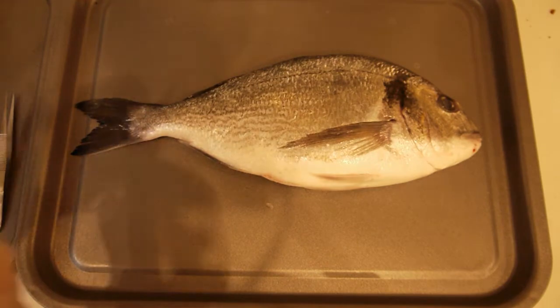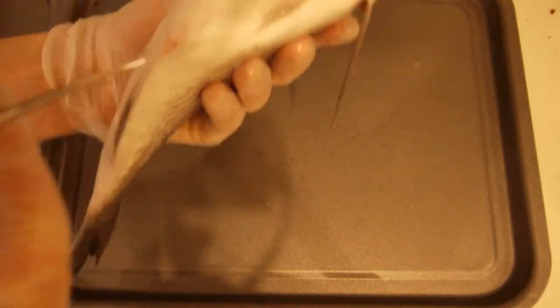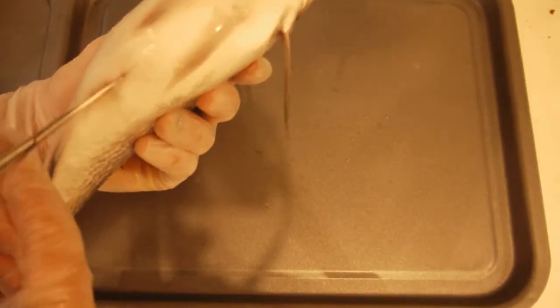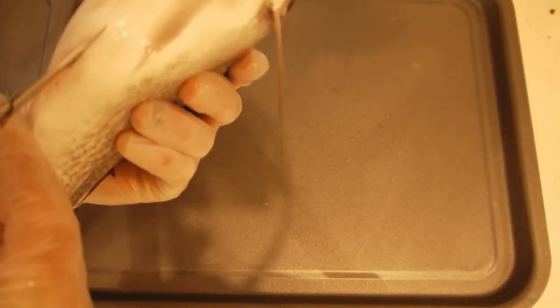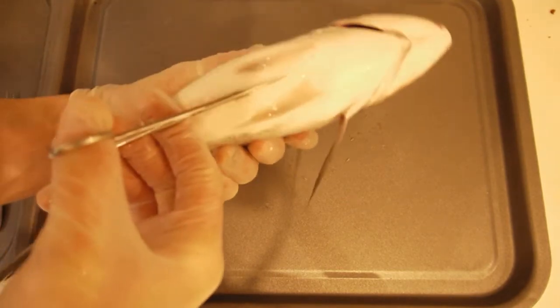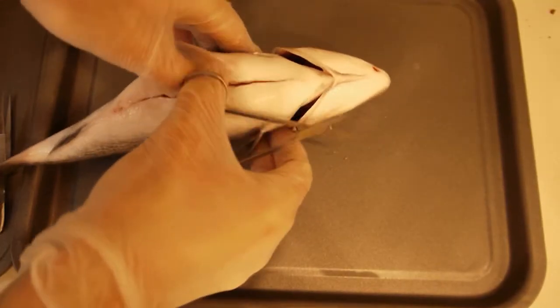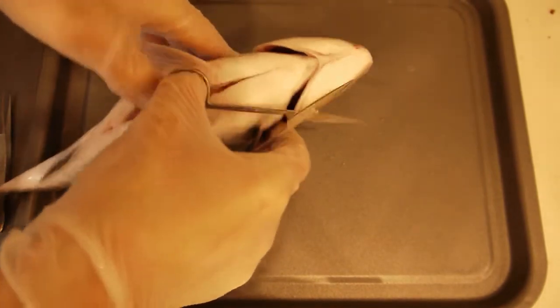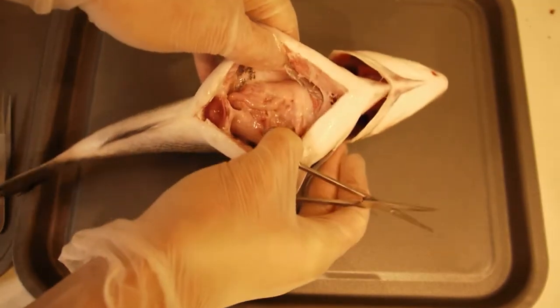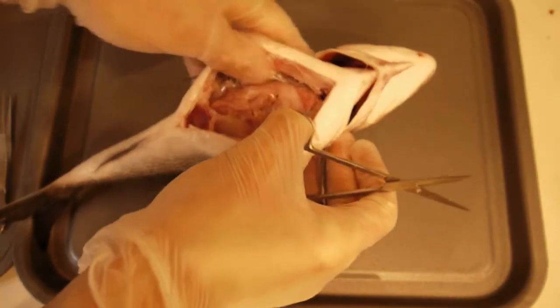I'm going to start by getting my scissors and snipping just cranial to the anus, just being nice and careful not to damage anything internal, like this. Now you can see the internal organs.